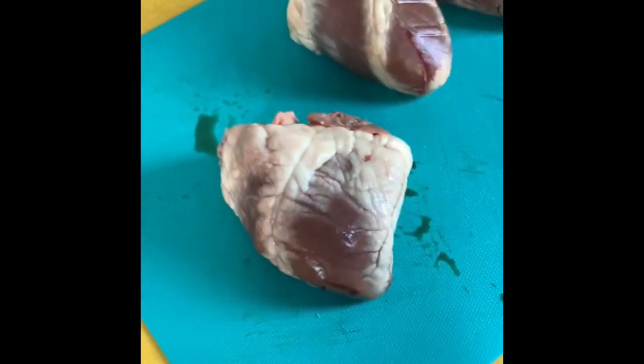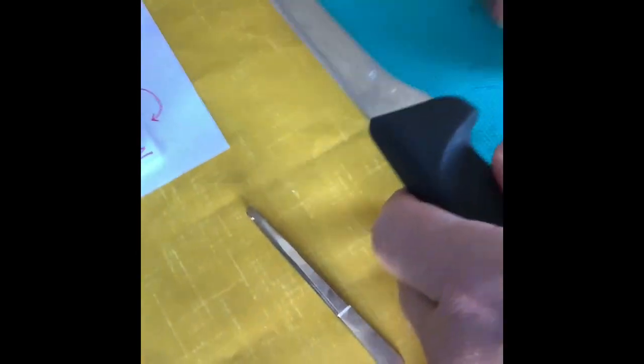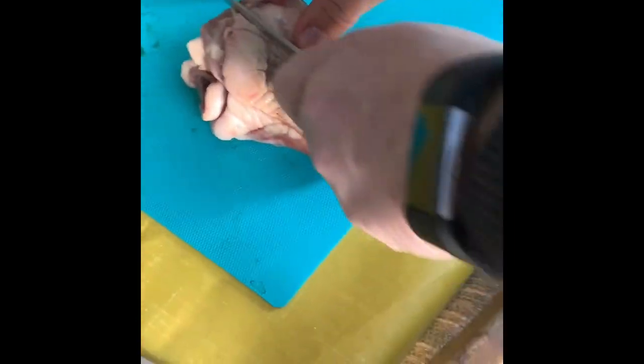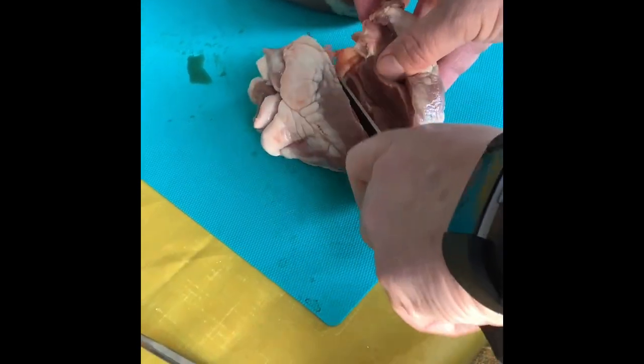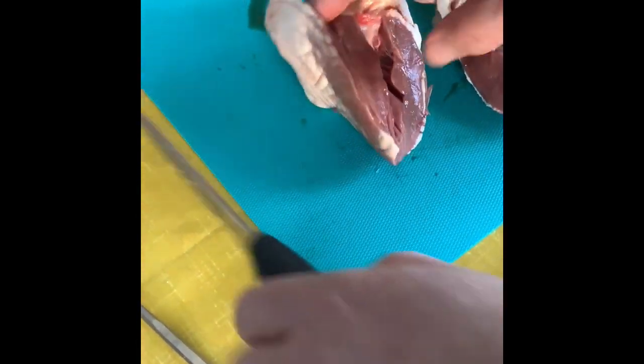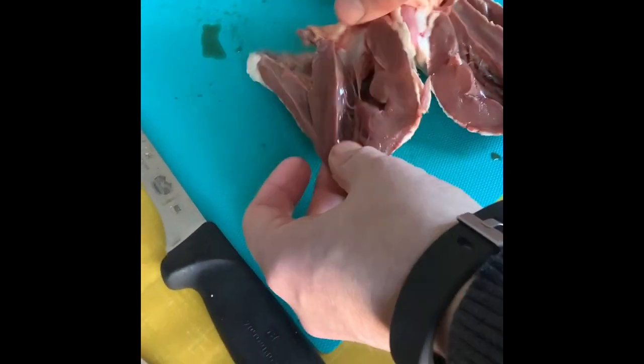I haven't got any proper dissection equipment, so I've got a boning knife and my wife's tweezers — better give them a good clean after! I'm just going to cut down the right-hand side and cut through to see what we get. It's a very ham-fisted dissection, but let's see what we can observe.